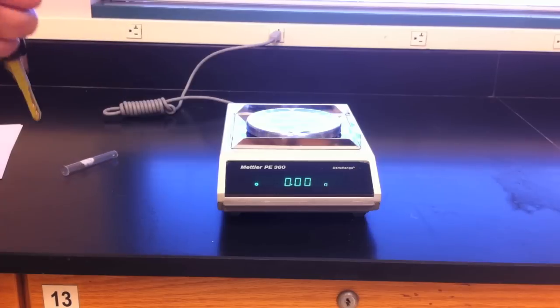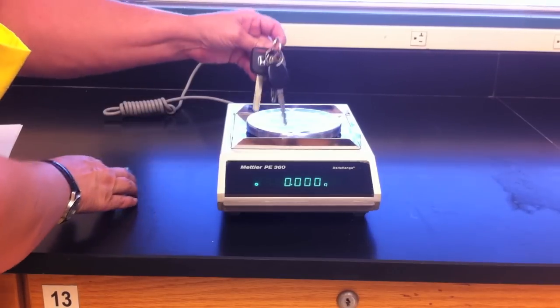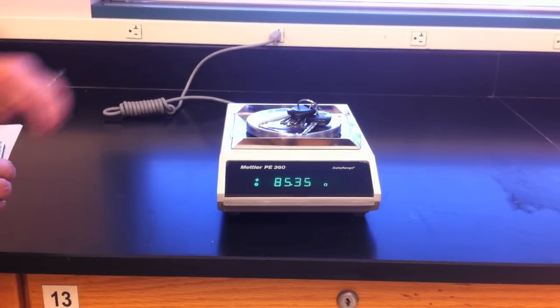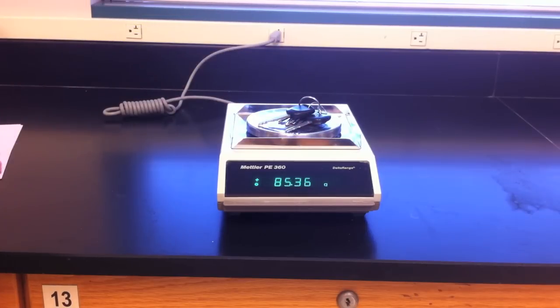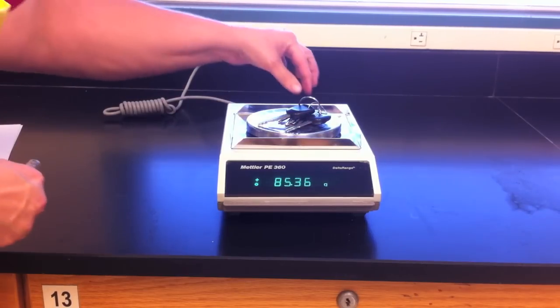For practice you can weigh a variety of objects to see how their mass changes depending upon the size that they have, such as keys, test tubes, cell phones, whatever you have.